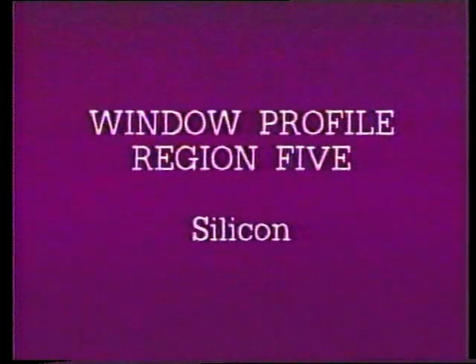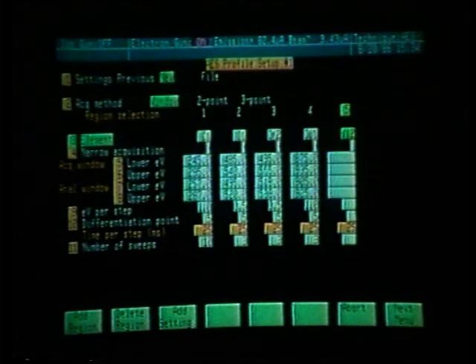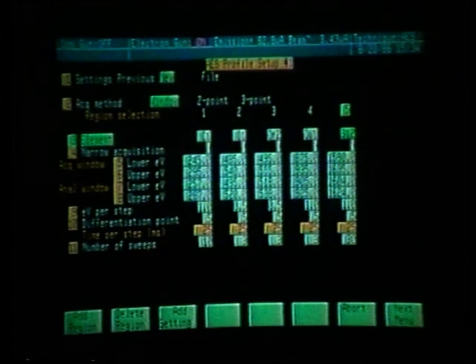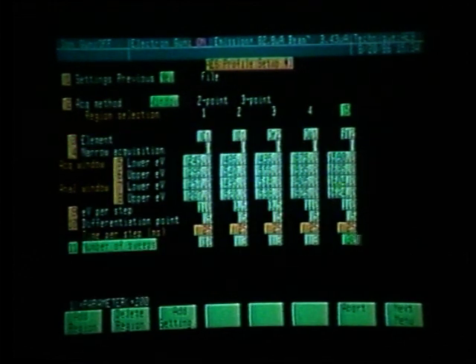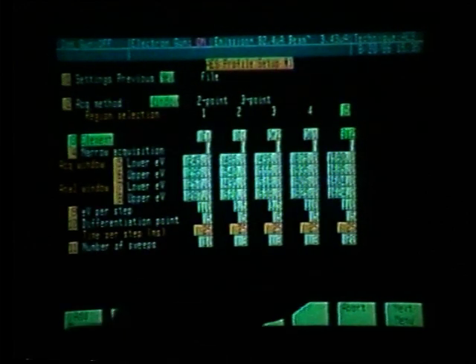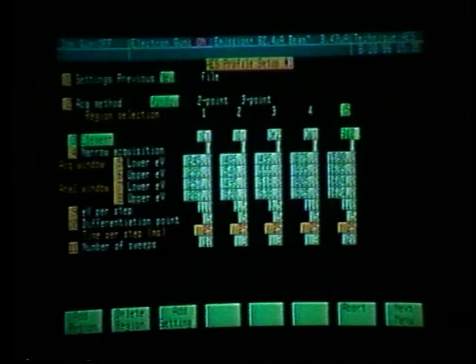And we can now add our last region, that being silicon, the Si2 peak. Again, the wide acquisition parameters, saying no to narrow, and we want 20 sweeps, function key 11 and 20. We are now ready to go to the next menu now that we have the proper parameters and number of sweeps which we predetermined for these elements.